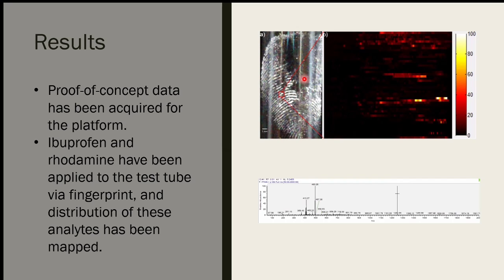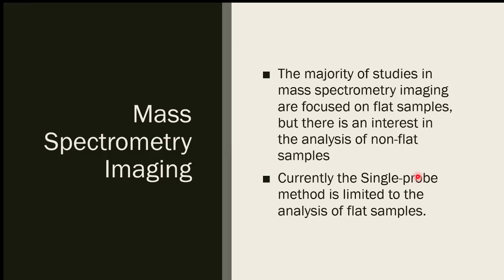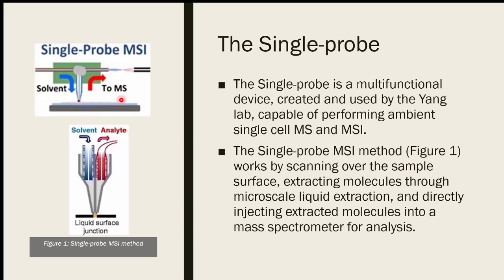Okay, so I'll go back to that part. Is it specifically for this probe right here? So here, what we do is we have some dual bore glass tubing, or quartz tubing, my bad. And we have these thin capillary tubes, which you can see here as well. We insert these into there after pulling the dual bore quartz tubing in a glass puller, or I don't exactly remember the name of the equipment.